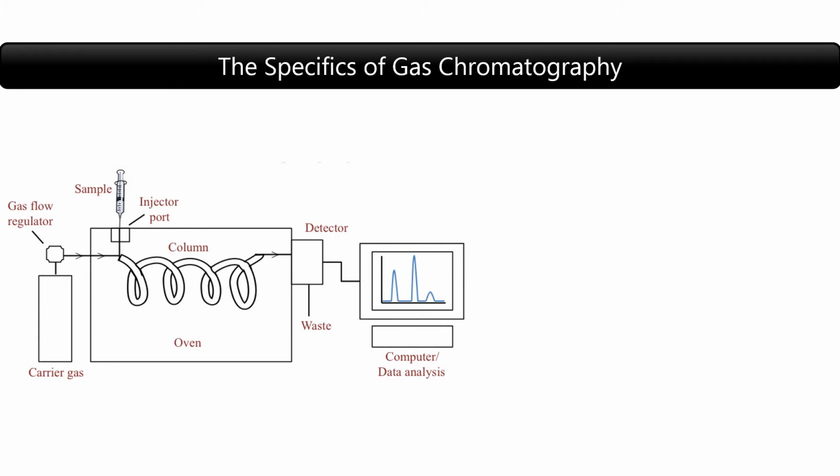Now let's take a look at how the inside of the gas chromatogram works.